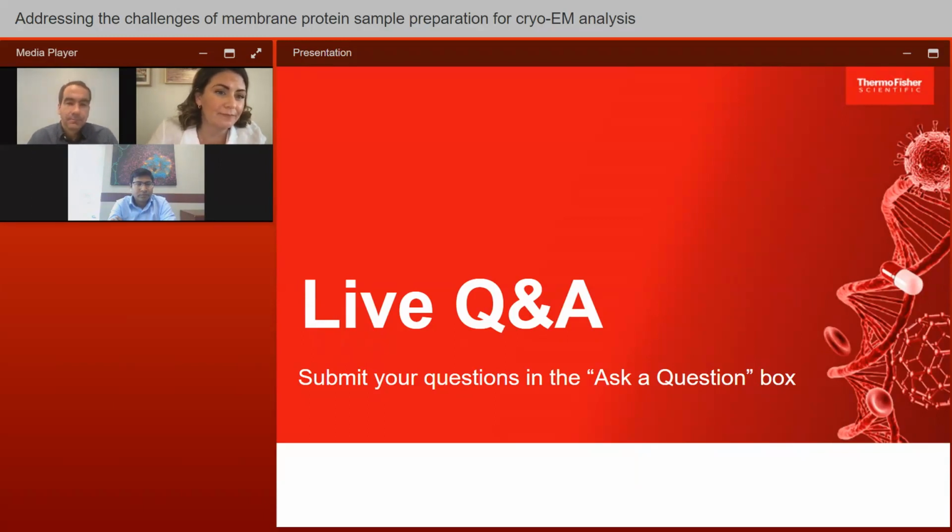Yeah. So let's see if my hypothesis holds true that we'll answer this all differently. Mahfuz, in your opinion, is it a good idea to use a single detergent for both solubilization and purification?